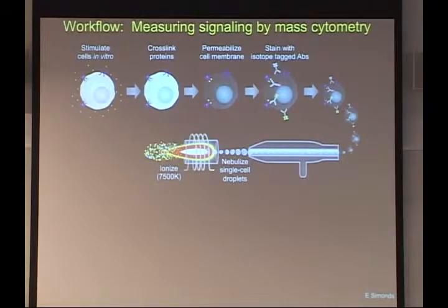So the plasma is basically argon gas being passed through a copper coil, and the copper coil is a radio frequency coil with a very high amount of energy being put into it. So what's happening is there's a few thousand watts of energy being put into this coil, and the field's oscillating really fast. All of the argon atoms get really, really excited, and we throw a little bit of a spark in there. Those electrons hit an excited argon atom. It kicks off some more electrons, and it's this chain reaction. You end up with this cloud of positively charged argon atoms and electrons.